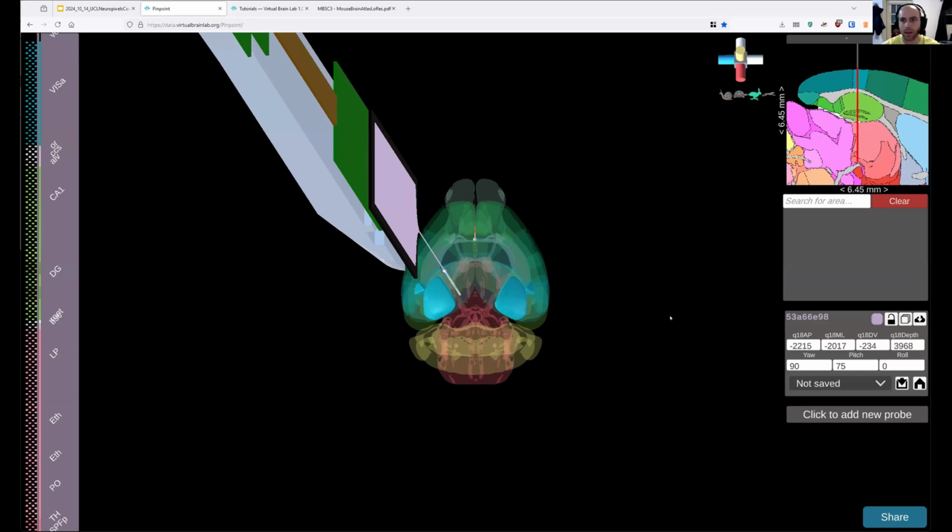All right. So that's it for the Pinpoint demo. There's a lot of other features in here, but again, I'll point you to the tutorials to go and look at those. And I think I'll jump back to the slides and talk about some of the features that we're developing right now and the changes that are coming to Pinpoint in the future.